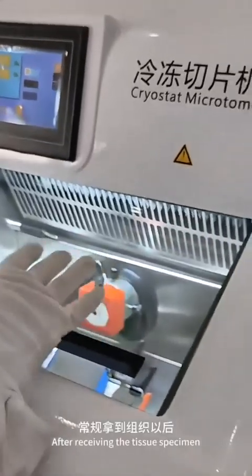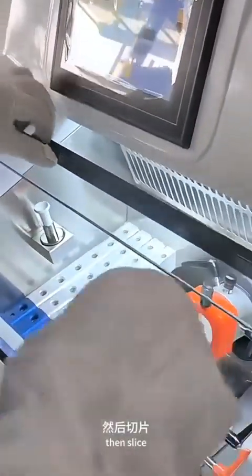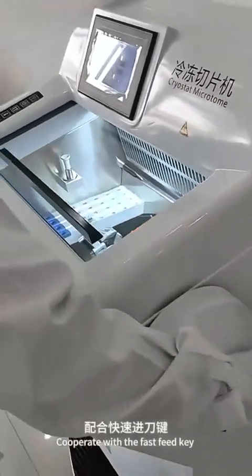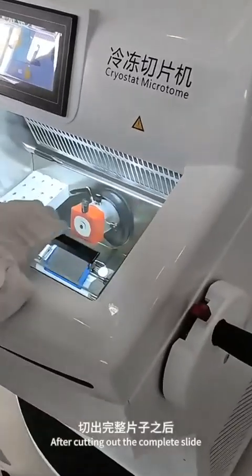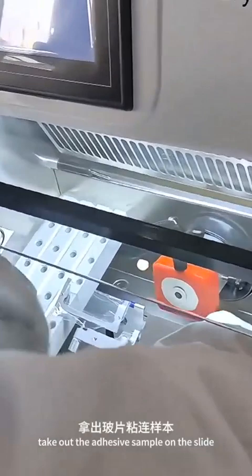After receiving the tissue specimen, it is customary to perform a cold treatment first, then slice. Open the handwheel lock and cooperate with the fast feed key to rotate up and down. After cutting out the complete slide, take out the adhesive sample on the slide.